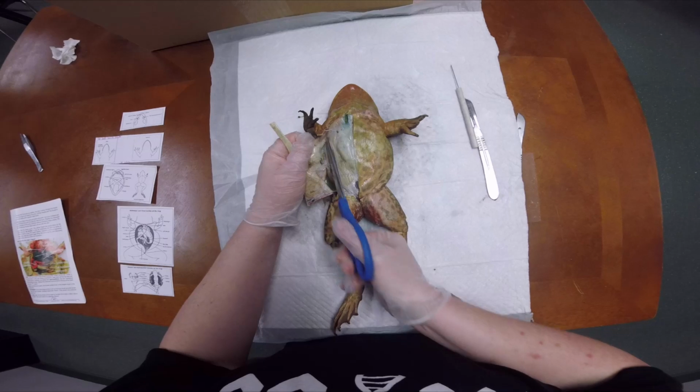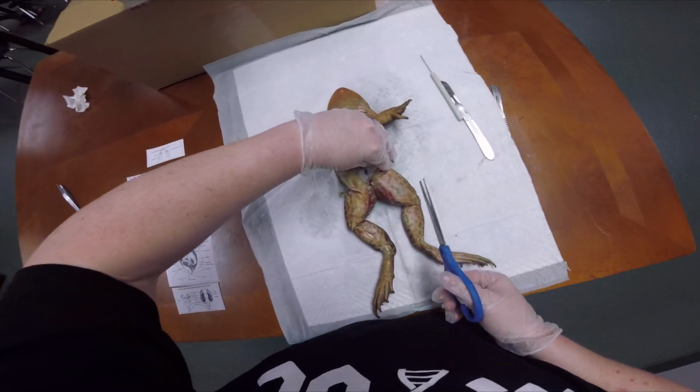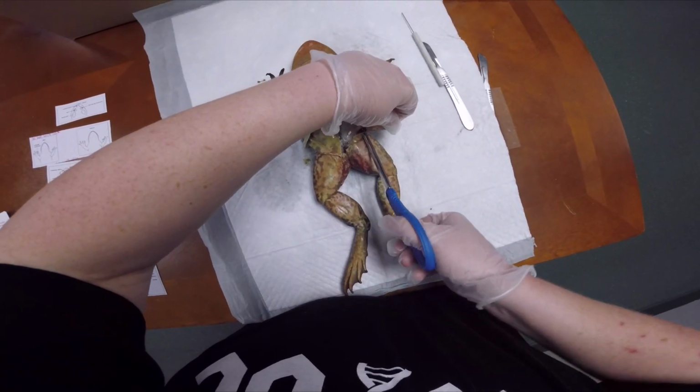Because you want to be able to peel the skin back and get it out of the way.